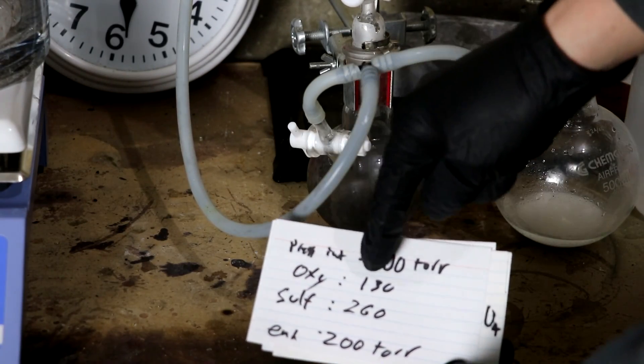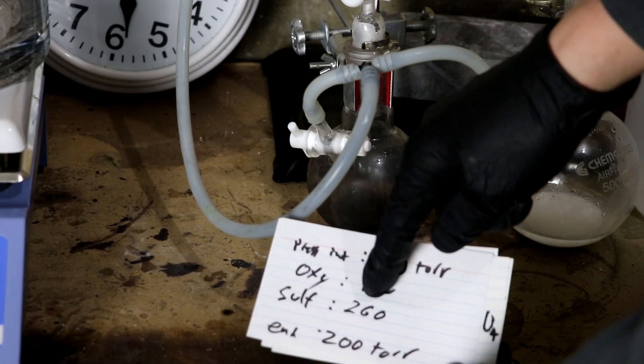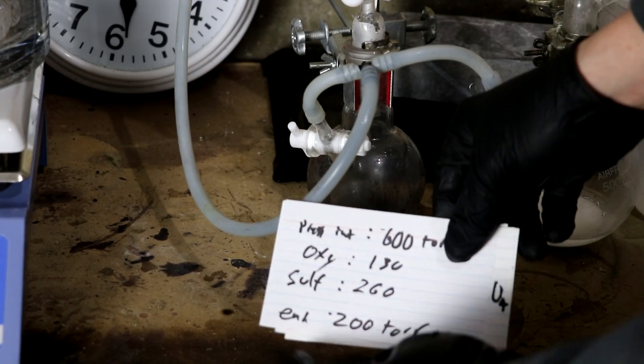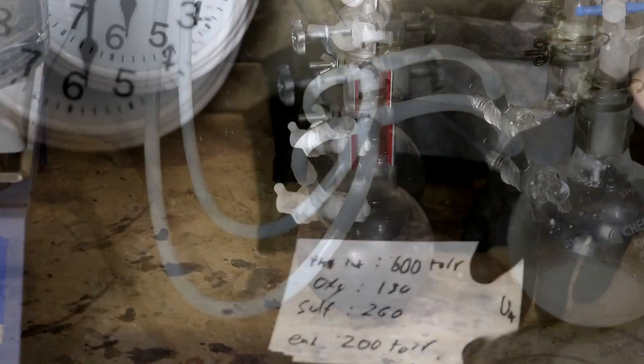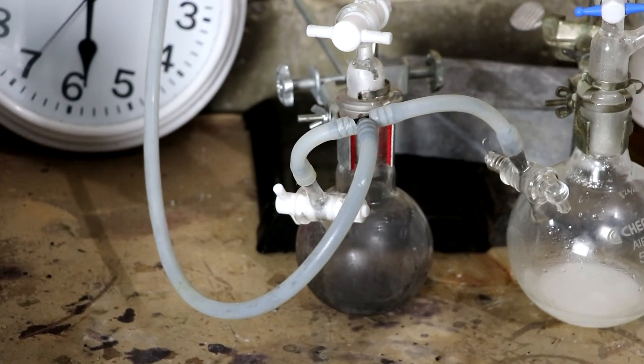So I'm going to take the pressure which is currently at negative 600 torr, 24 inches of mercury, to, I'm going to add 130 of oxygen and then about 260 of sulfur dioxide so I end up with a negative 200 torr. Alright, time to add in the gases.